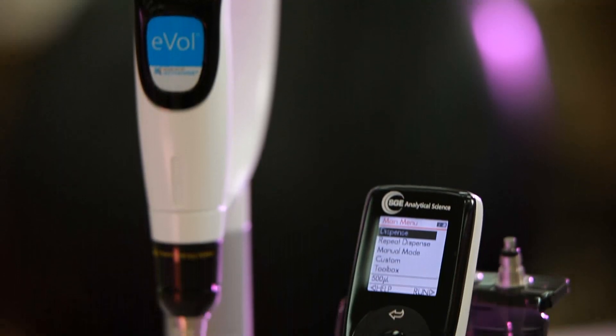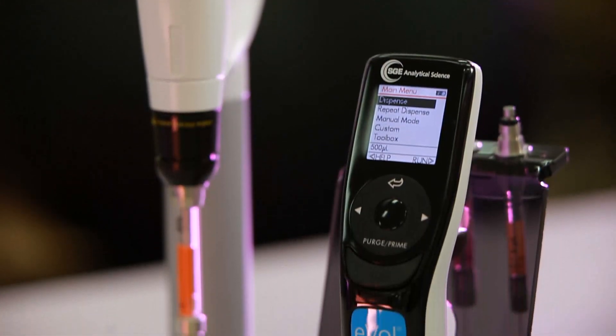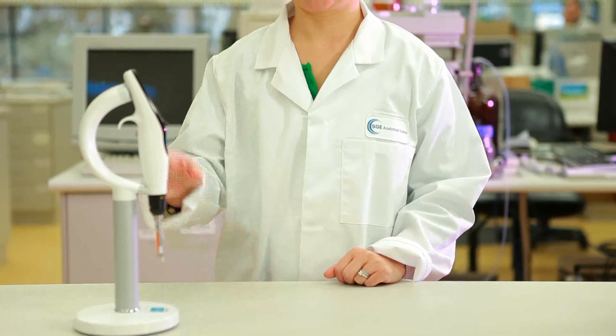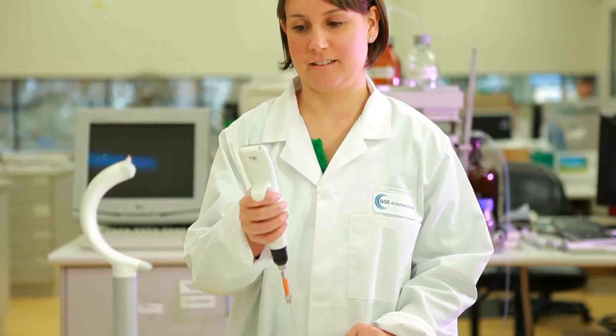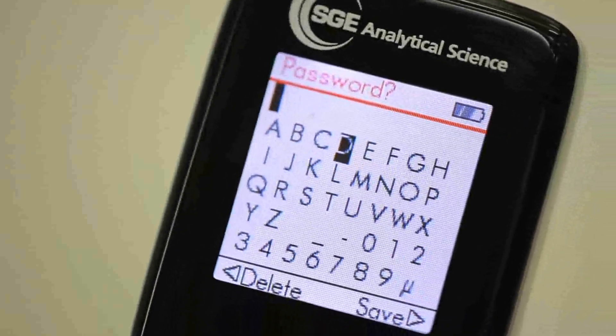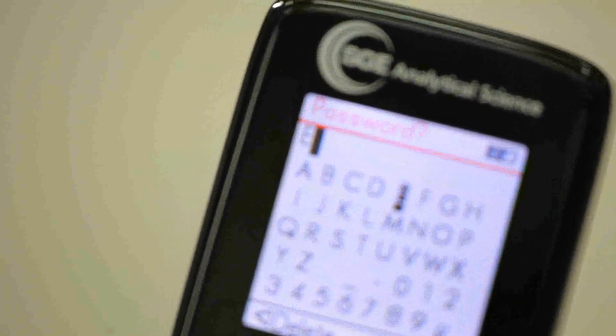With the EVOL digital analytical syringe, the settings can be write protected to provide limited access to secondary users. Once a password has been set, it must be entered in order to gain access to the Write Protect screen, preventing users from changing the write protection options once they have been set.